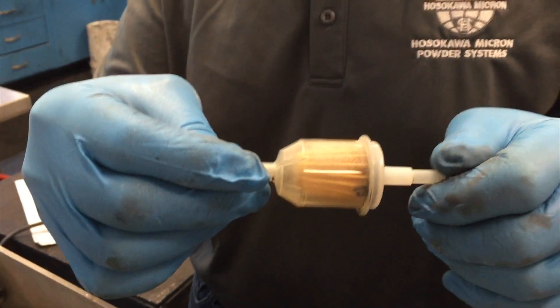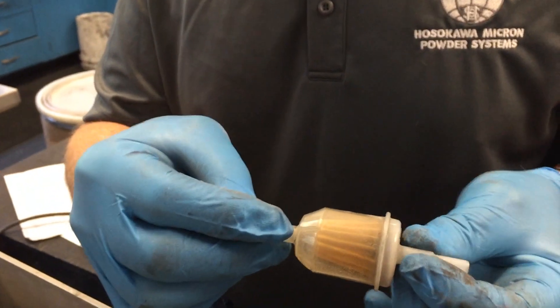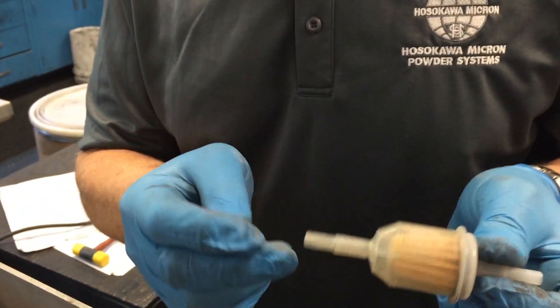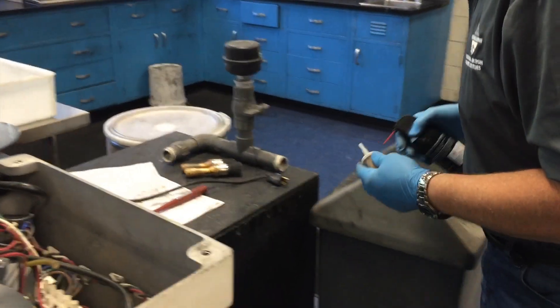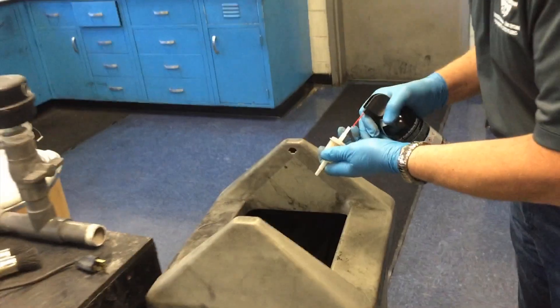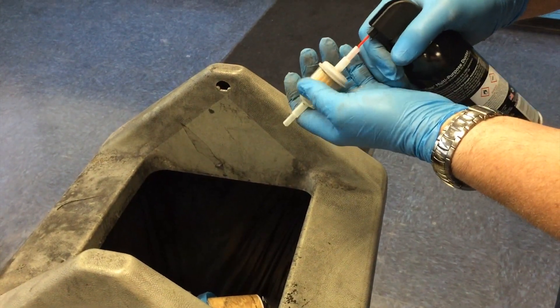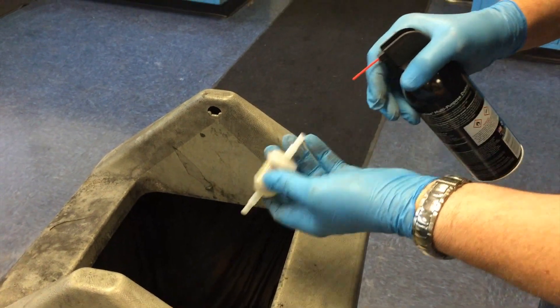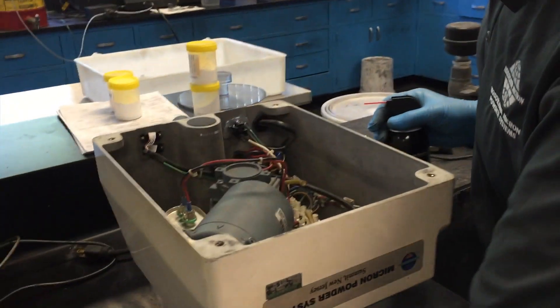As you can see, there is some material within the filter. The filter can either be completely replaced or it can be cleaned out by using canned air. The material was blown out, so we'll let this set while we inspect the rest.